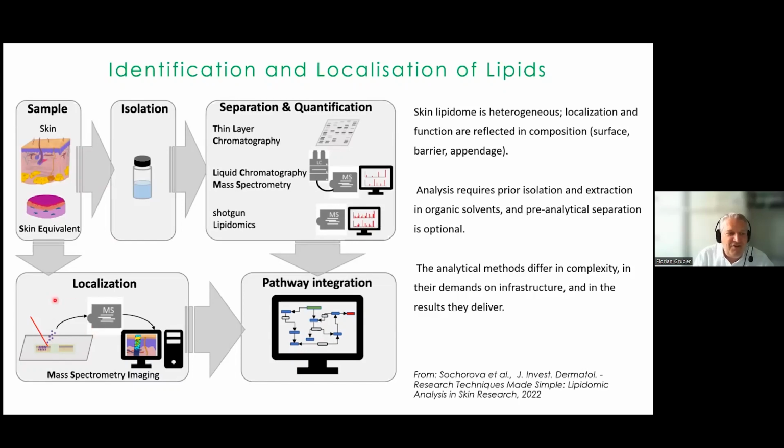Newer evolving technologies, and we will come to that, mass spec imaging for example, allow us to analyze the lipids in their tissue context. This new development discloses a big gap, because specific lipids, or lipids in general, can rarely be localized and detected with antibodies or other technologies that are useful in histology.